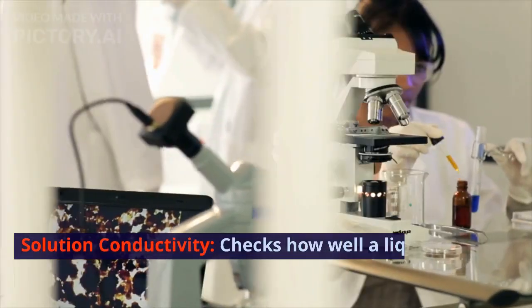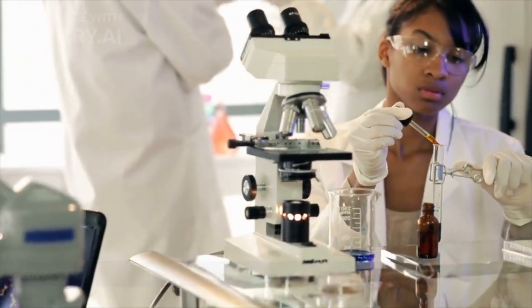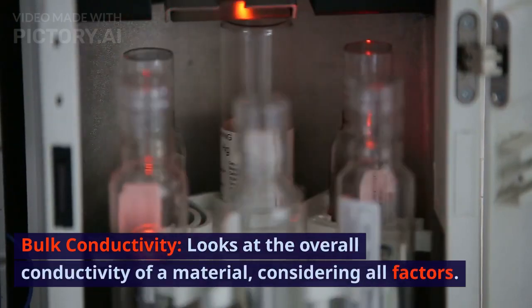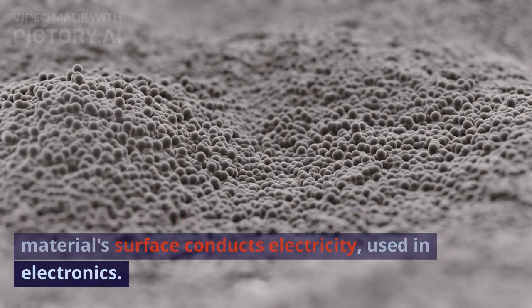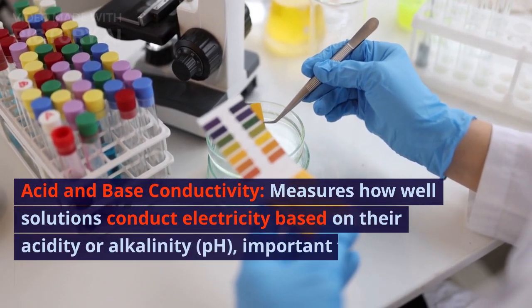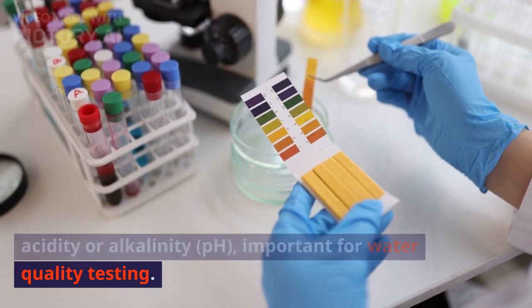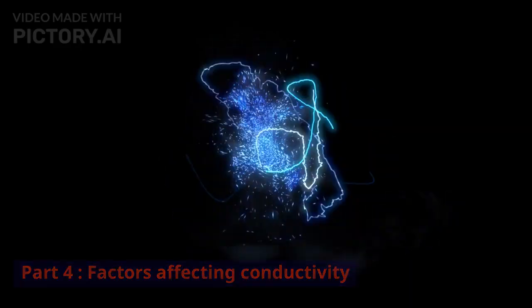Solution conductivity checks how well a liquid can conduct electricity, often in chemistry. Bulk conductivity looks at the overall conductivity of a material, considering all factors. Surface conductivity assesses how well a material's surface conducts electricity, used in electronics. Acid and base conductivity measures how well solutions conduct electricity based on their acidity or alkalinity, pH, important for water quality testing.